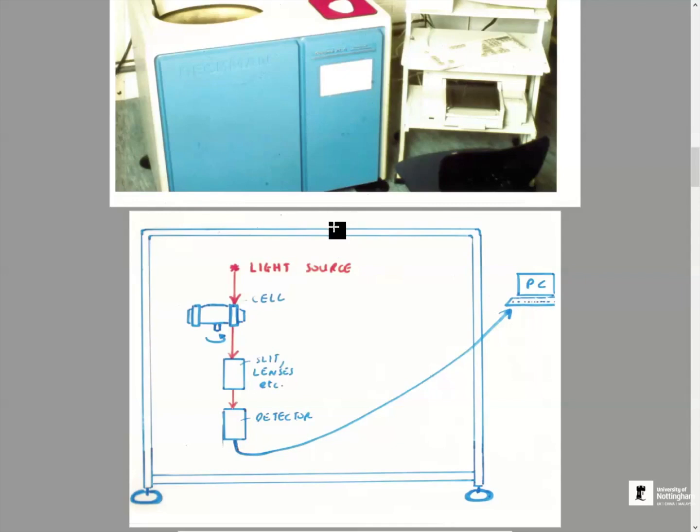Oh, that's good, you've done all that. So we see how all these optical systems fit in now, and this is built into the centrifuge. You've got the choice between UV or refractive index optics, which we can also use for proteins, by the way. You don't have to use just ultraviolet optics for proteins. You can use refractive index optics, as you can for any macromolecule.